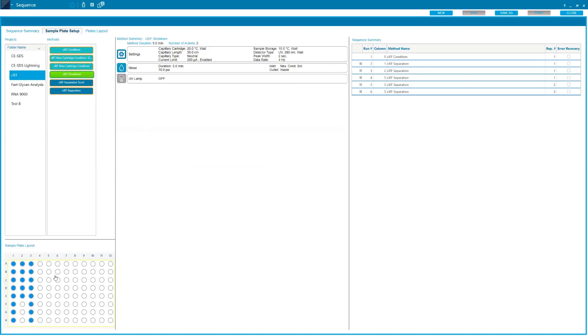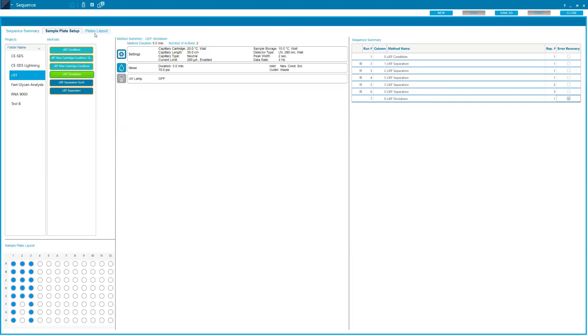The last thing we're going to do is add our shutdown method. And again, this is going to highlight the whole 96-well plate because there's no sample injection. But we can click over here, error recovery. What that's going to do is if the instrument runs into any error, it's going to try and run the shutdown method. It's not just going to hang up in the middle of a run, but it will try to run this method so that your capillary is stored safely.